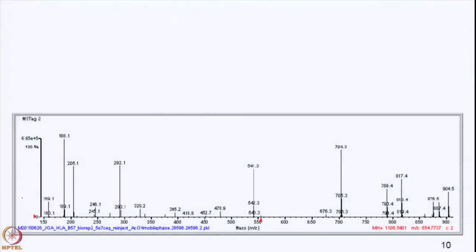All right, let's take a look at the next one that we have here. I'll give you some advance warning that this is not a tryptic peptide. This comes from an immunopeptidomics experiment, so MHC or HLA peptides, human leukocyte antigen peptides, have been isolated. This comes from the allele B57, which has a motif where the C terminus is usually tryptophan or phenylalanine. The amino acid mass for tryptophan is 186. Phenylalanine is 147.